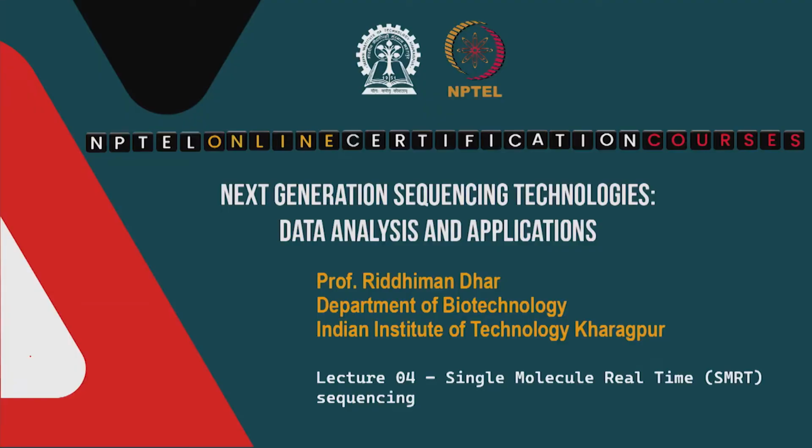Good day everyone, welcome to the course on next generation sequencing technologies, data analysis and applications. In the last few classes we have been discussing different next generation sequencing technologies such as 454 sequencing and Illumina. So, today we will be discussing one more technology, which is called single molecule real time sequencing, or in short SMRT sequencing, and we will see how this method is different compared to the last two that we have discussed so far. So, let us begin.